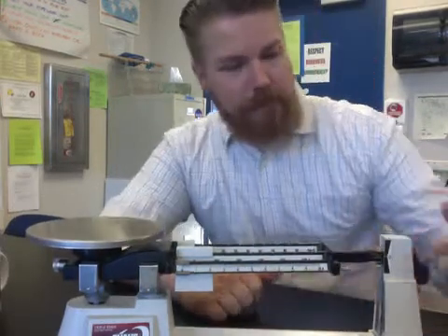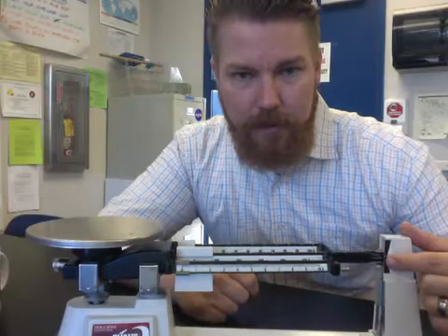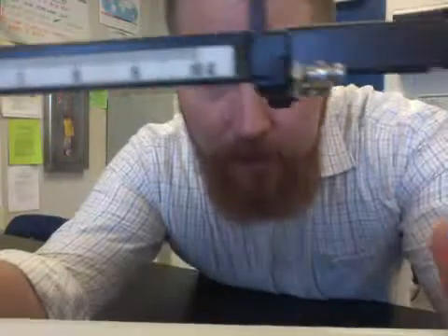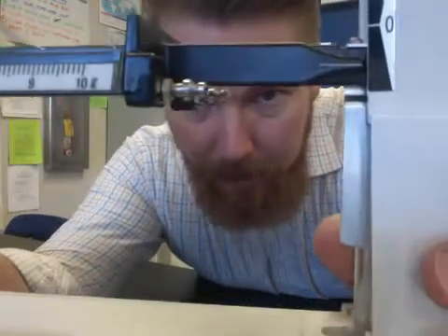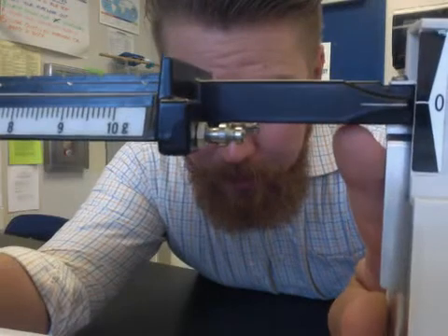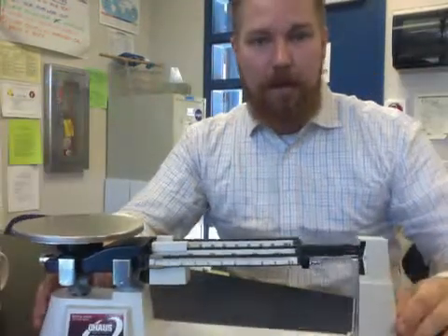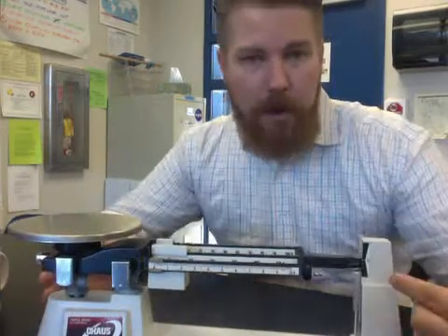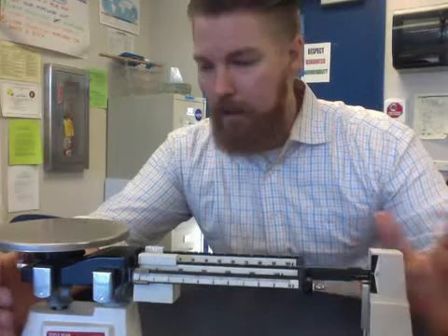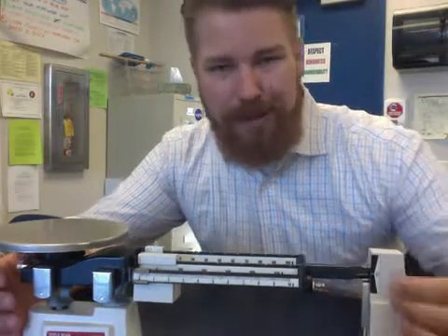The next thing we want to do is look at these two lines — there's one by the zero and one on the arm of the balance. We want those to line up perfectly. If they're already lined up, great, you can start using it. But if not, we want to use this knob right here — the zero adjust knob — to adjust the balance so it lines up perfect on zero.